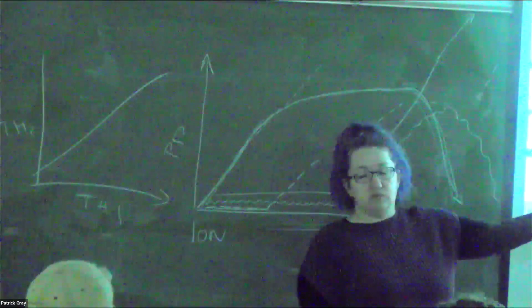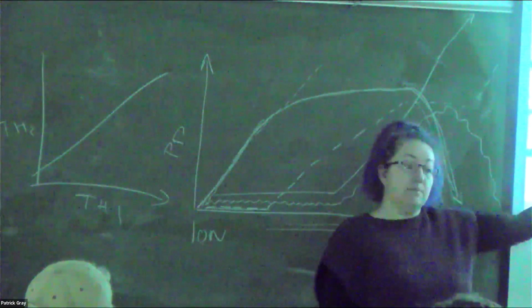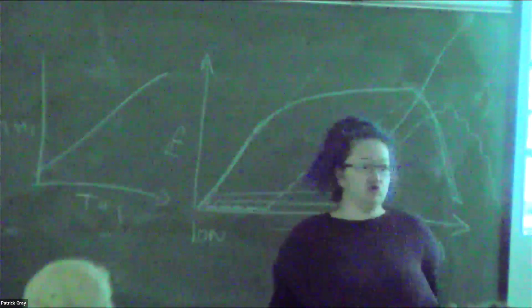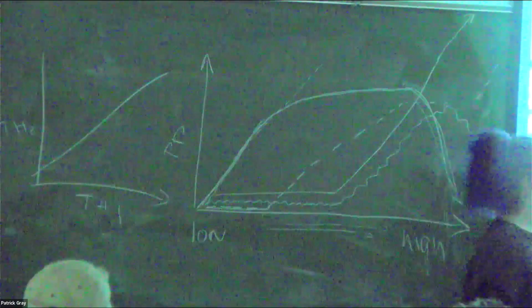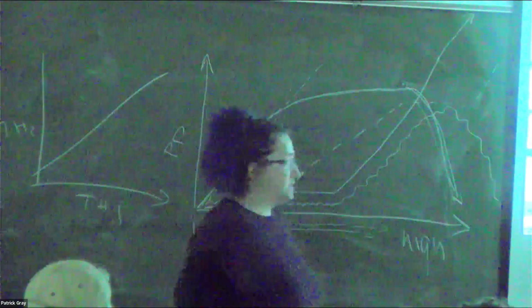If it's stressed because of nutrients, it will impact the chlorophyll yield. It will, if it's cold, if it's hot, there are so many different things. So our chlorophyll fluorescence measured by that EcoPuck is not really relatable, to the furthest extent, to chlorophyll.